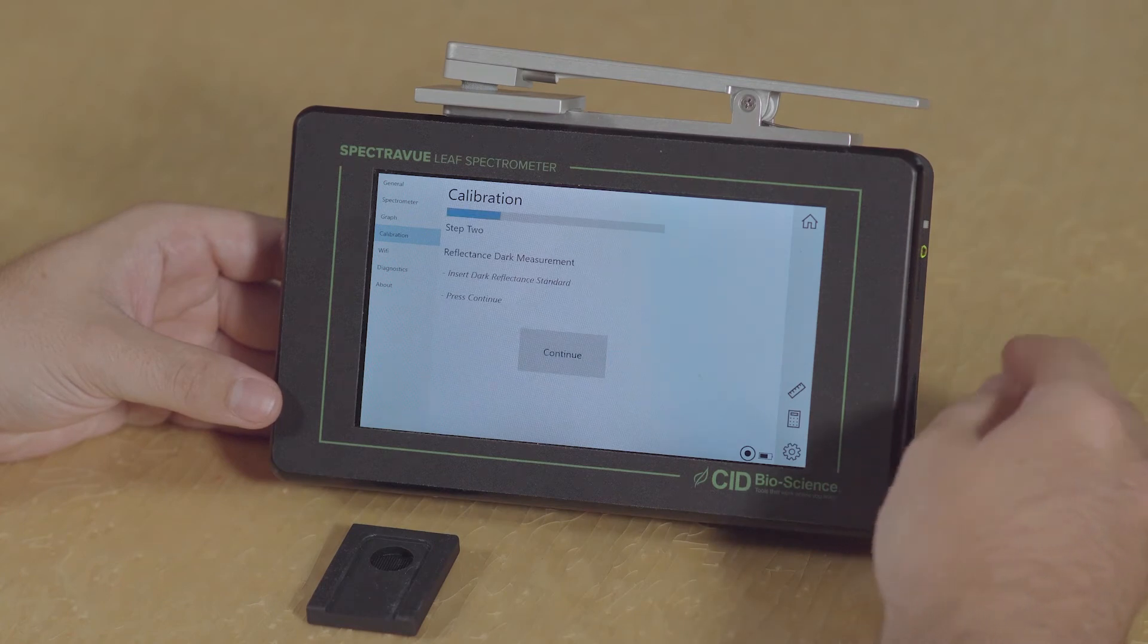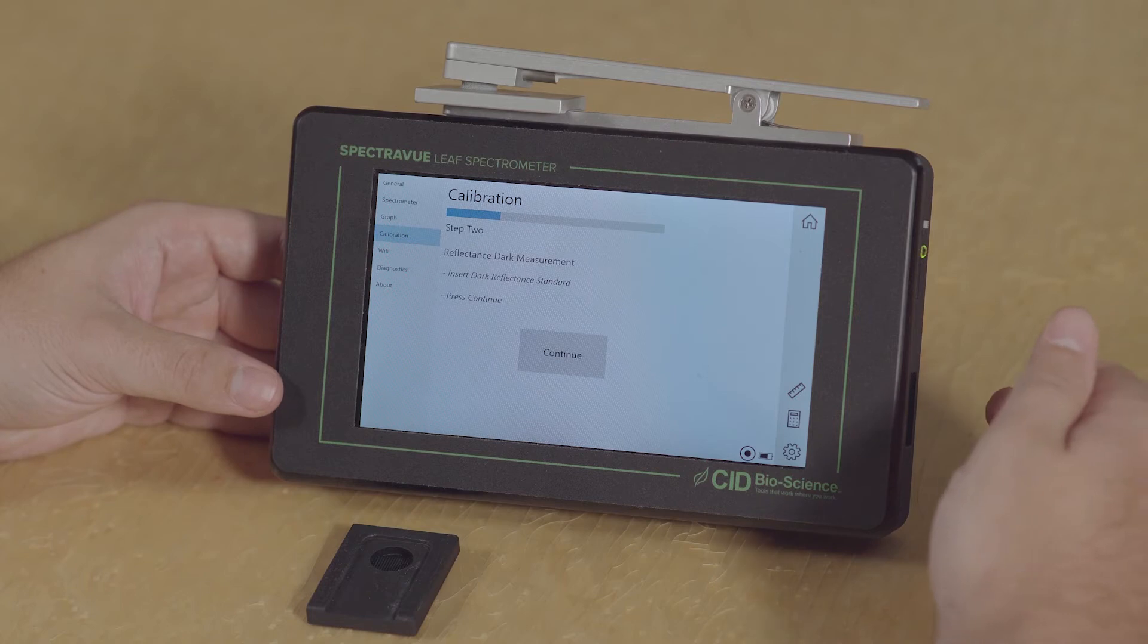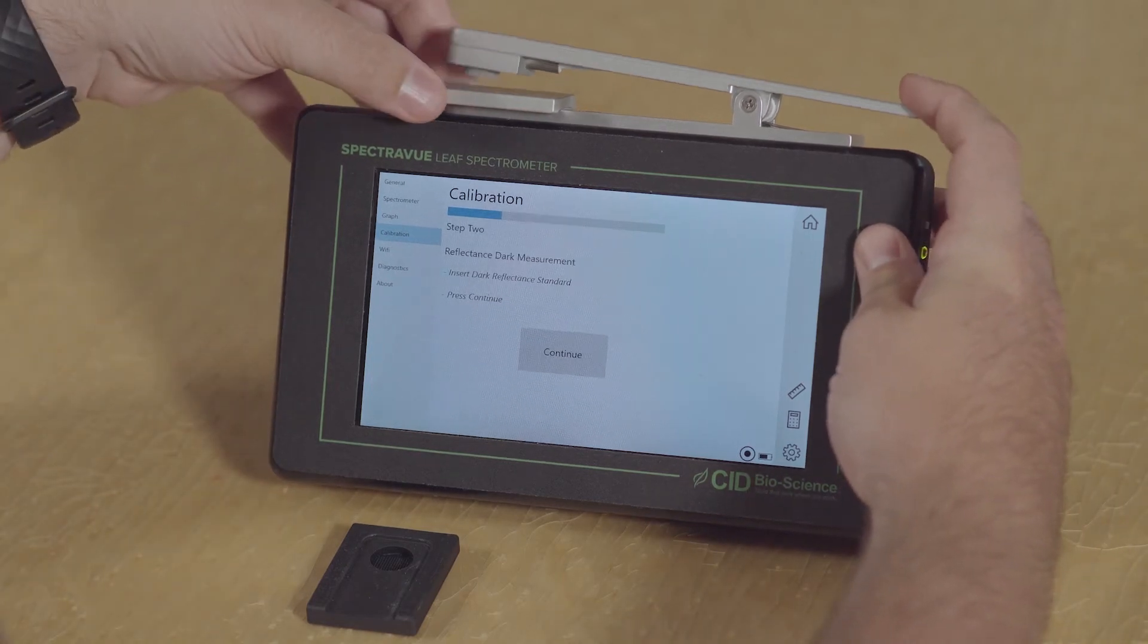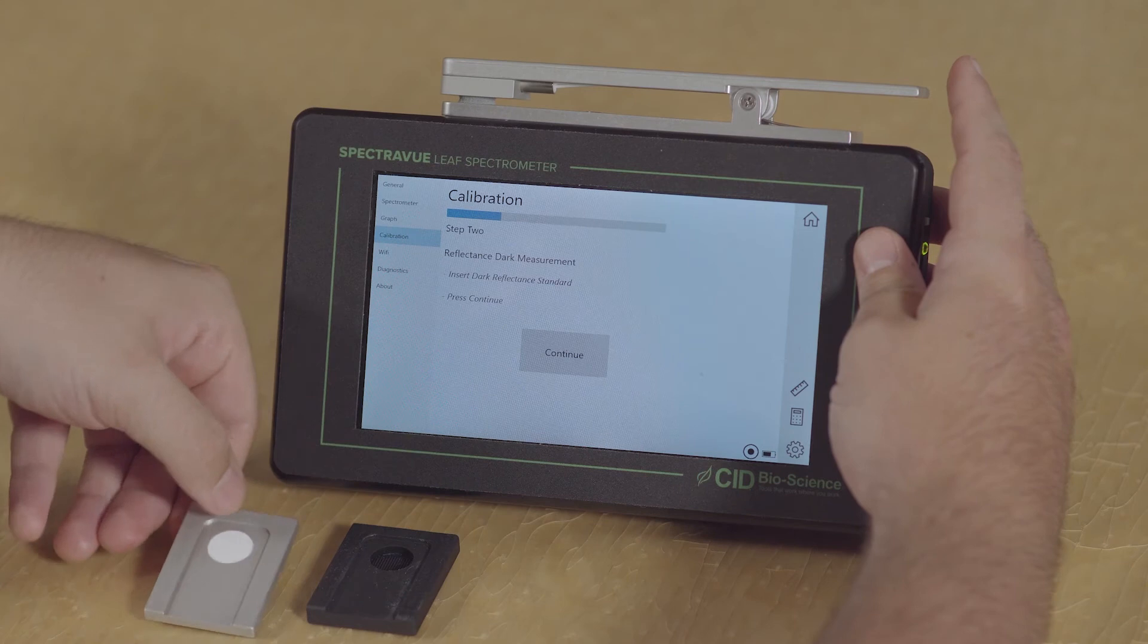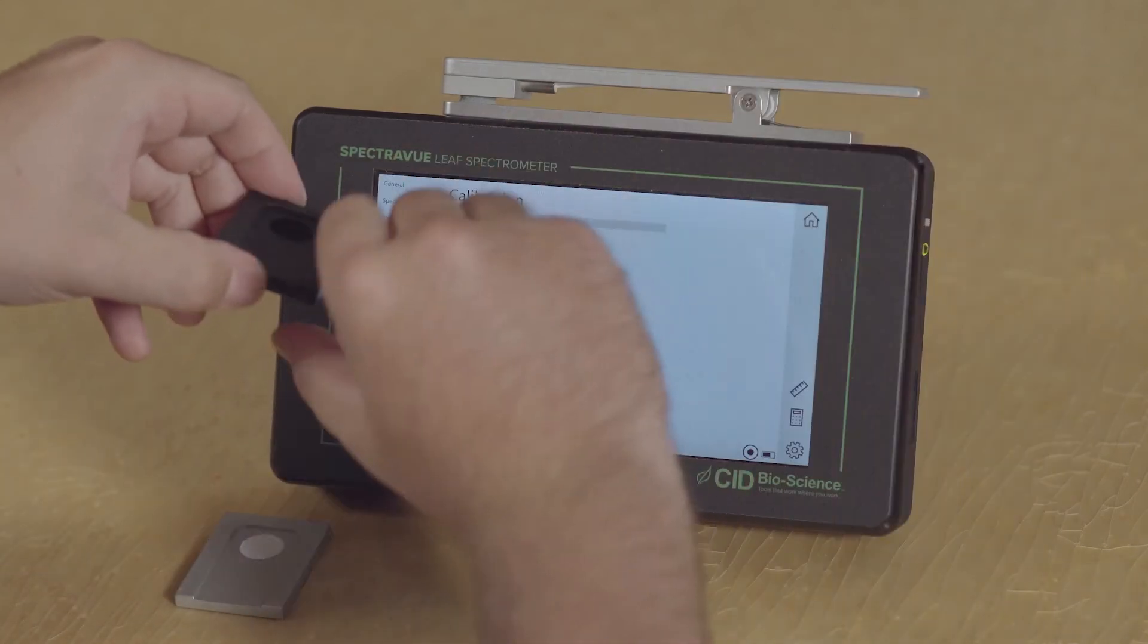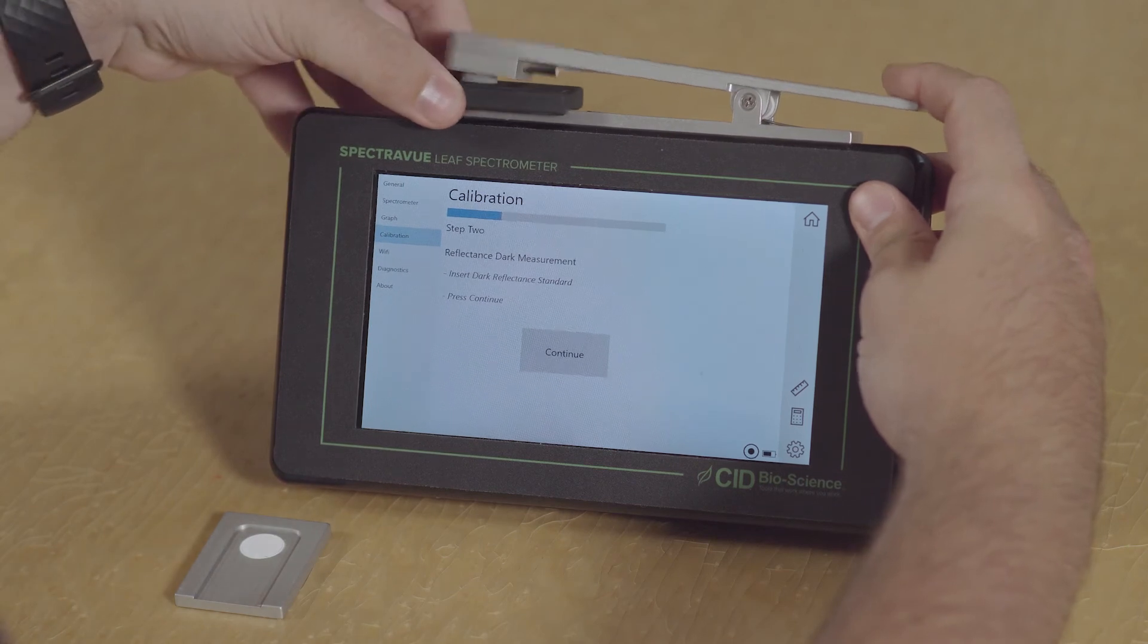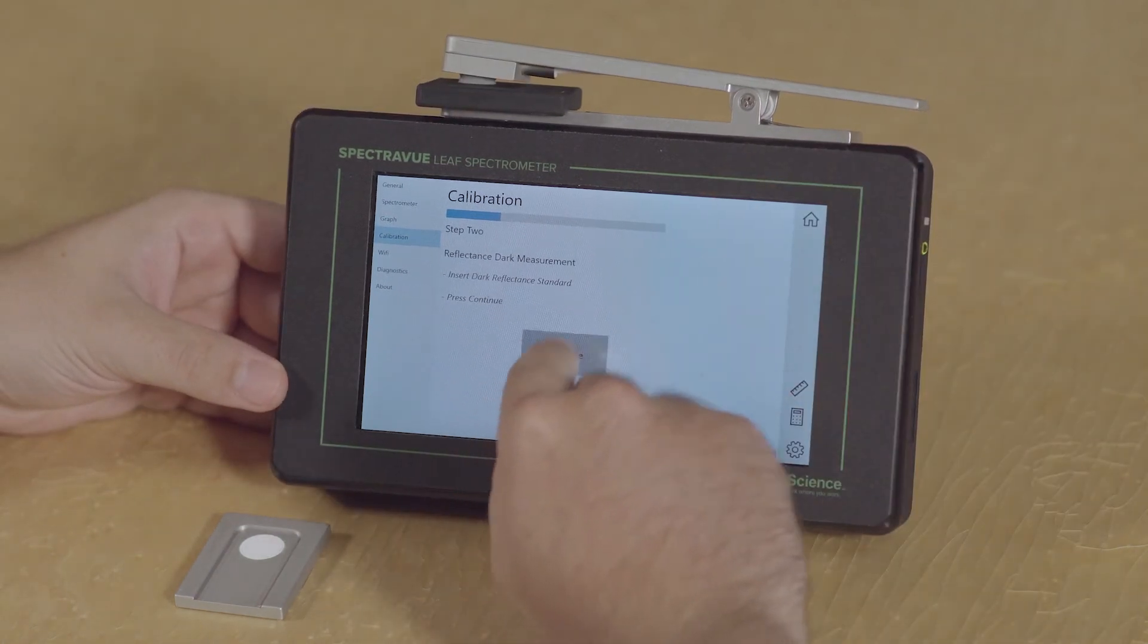Now it's prompting us to remove that light reflectance standard and insert the dark reflectance standard, and we're going to do that in the same manner that we put the light reflectance standard in. And now we're going to press continue.